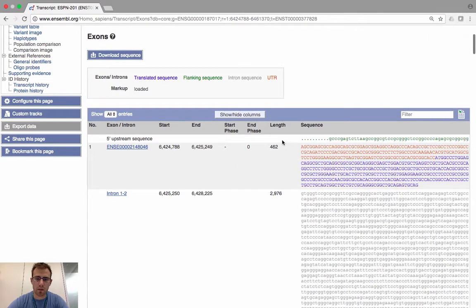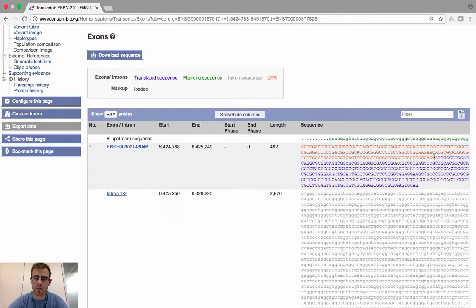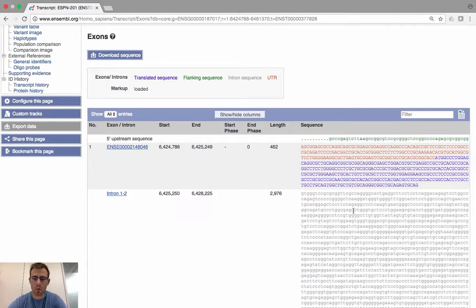The sequences are color-coordinated. Green indicates five-prime upstream flanking sequence, as shown in the legend at the top. Looking at the exon sequence, red denotes UTR sequence — so this is a five-prime UTR section of the first exon. Blue sequence is the translated coding sequence — you can see the ATG start codon here, which encodes the methionine, followed by the rest of the coding sequence of this first exon.